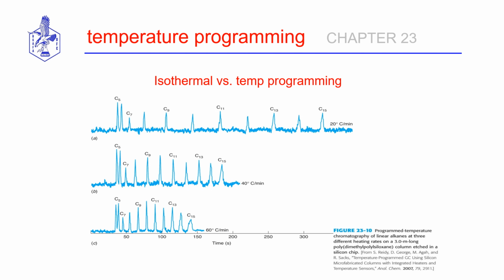So thus far we have selected our capillary columns, the diameters, the stationary phase material, the thickness of the stationary phase, the nature of the stationary phase. We've optimized the mobile phase, and we've optimized our sample introduction in terms of the preparation of the sample and how we're going to inject it on the column. So a final set of parameters that you will need to communicate to the software before you conduct a gas chromatography separation is the temperature of all of your ovens, and then are you going to change the temperature at any point during the separation?